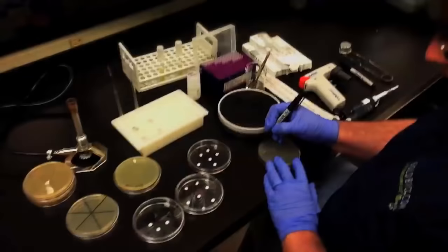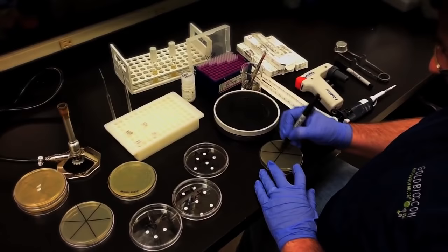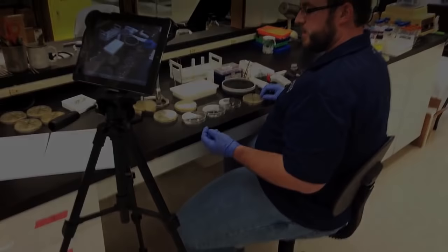Label your agar plates in a way that sections off each test disc so you can differentiate them after incubation. I use six sections because I use a blank disc, two control discs, and three discs for the antibiotic I'm testing in order to make sure that I get a better estimate of the antibiotics functionality.